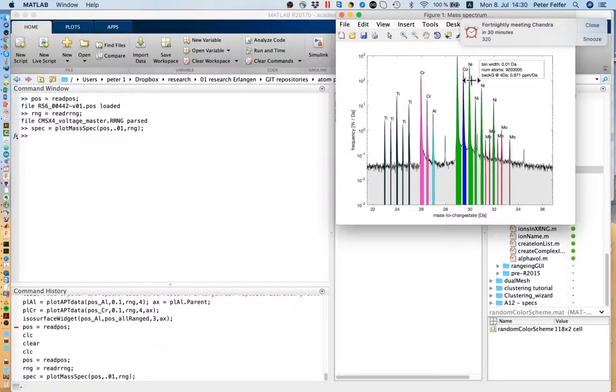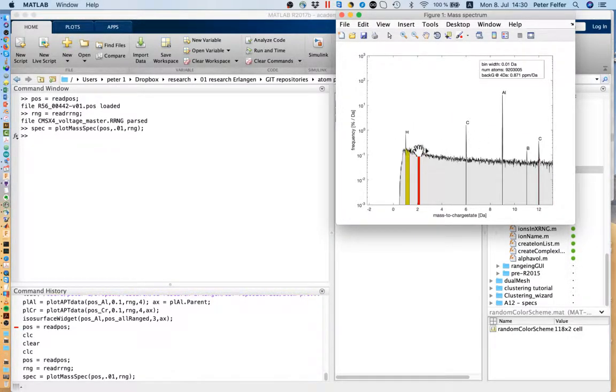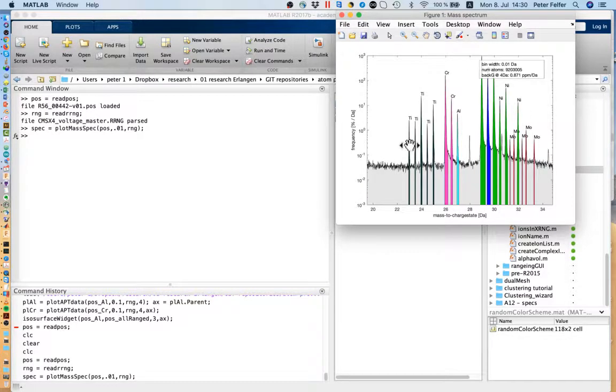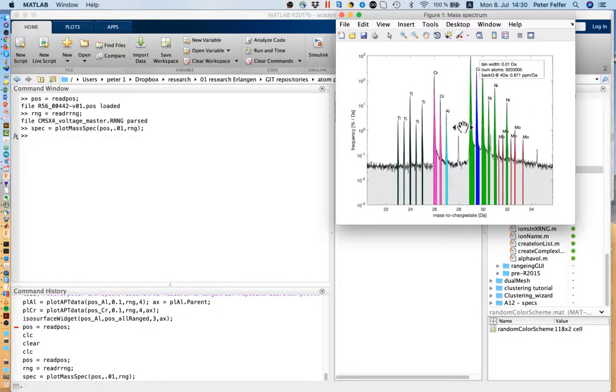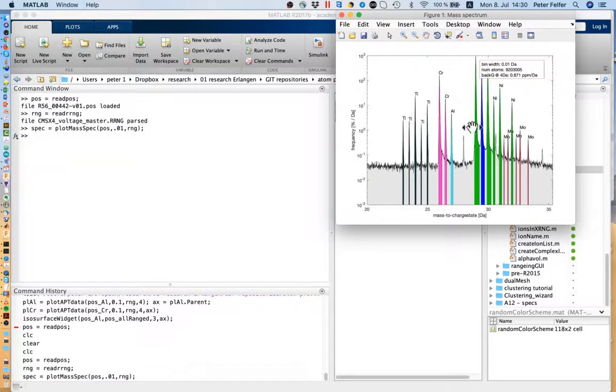The reason why the background at 4 Dalton is shown is because usually there isn't much happening at 4 Dalton, because hydrogen is usually 1, 2, or 3, nothing at 4, and then usually carbon's the next one at 6. Obviously, that's not always true. Sometimes that's actually not true at all. And then we've got all of the different things here.